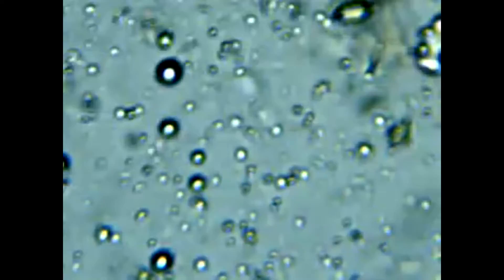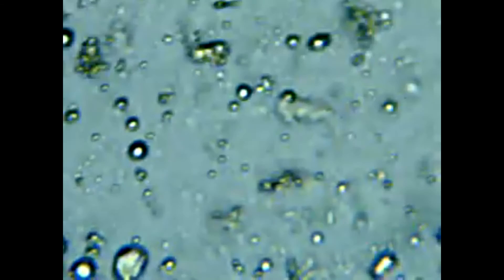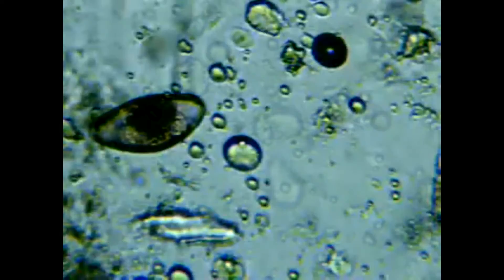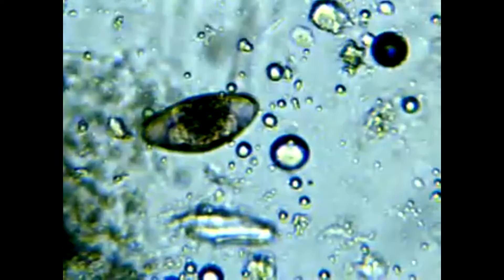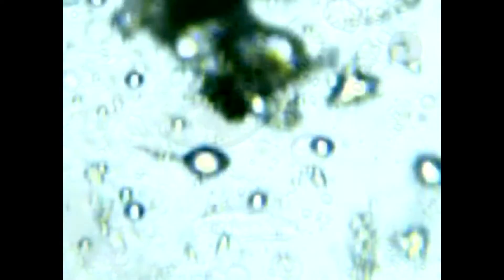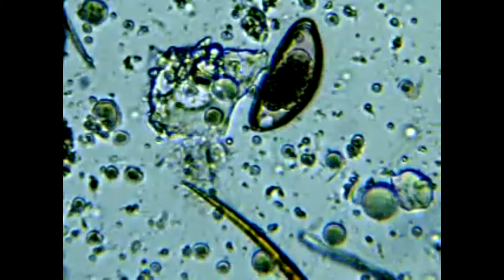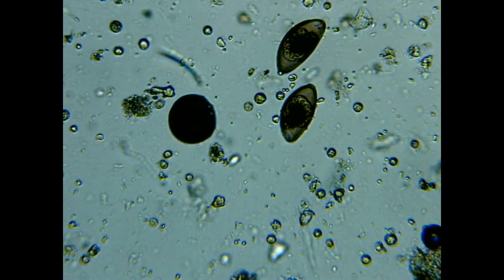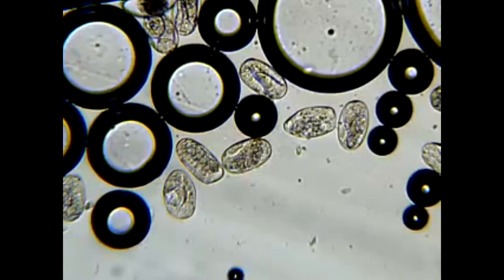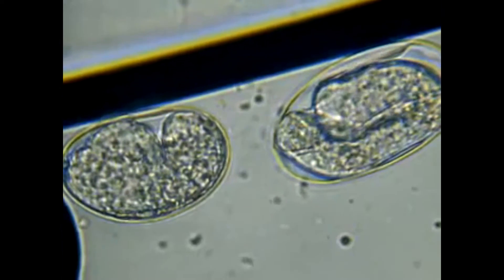You will see a lot of debris and some may even be recognizable as cricket parts or feeder parts. It will be your job to pick out any worms or eggs. When you come across an egg, like a pinworm egg, it sticks out from the rest. If you find an egg, keep scanning the slide and look for more. They might be scattered sporadically or all clumped together. You may even see the worms moving around inside the eggs.